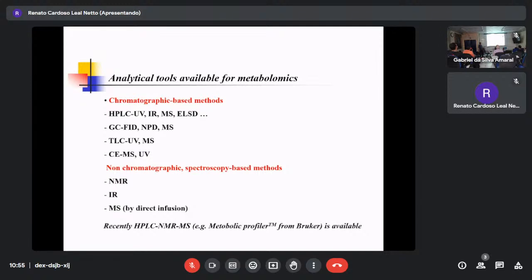And non-chromatographic methods. With non-chromatographic methods, we are using only detection. What's the problem? All the signals are in one spectrum. If you introduce a chromatographic system, you get a separate signal peak by peak. But with a non-chromatographic method, NMR, you can use it. In metabolomics, of course HPLC-NMR is possible, but usually NMR is used directly, and you measure a very complex spectrum of the mixture.